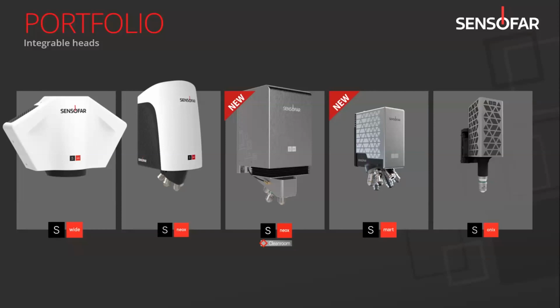Also, if you are in a production environment and you want all of this stuff to be done in line or near line, you can take each of the heads off of its stand and integrate them into your line or whatever you've got going on. So we recently launched the S-Mart 2 and the S-Neox Clean Room, which are in the middle there. The clean room is just our regular S-Neox head, but sealed in a special way and designed for use in a clean room somewhere. And the S-Mart 2 is our very small compact package version of the S-Neox that's designed, again, to be a bit more rugged and built for the shop floor somewhere.